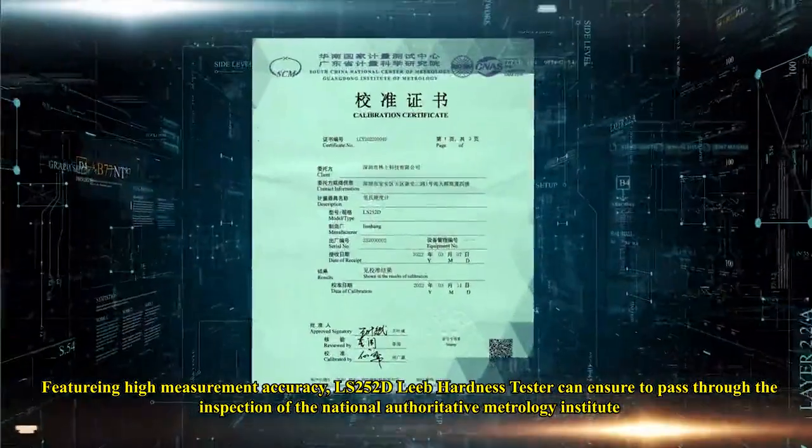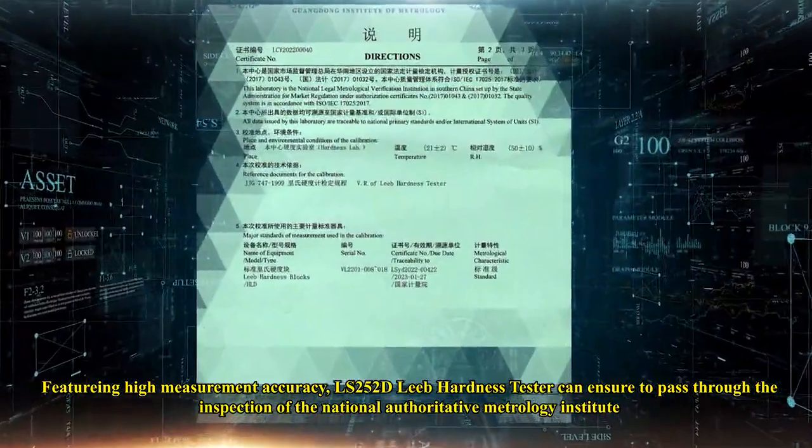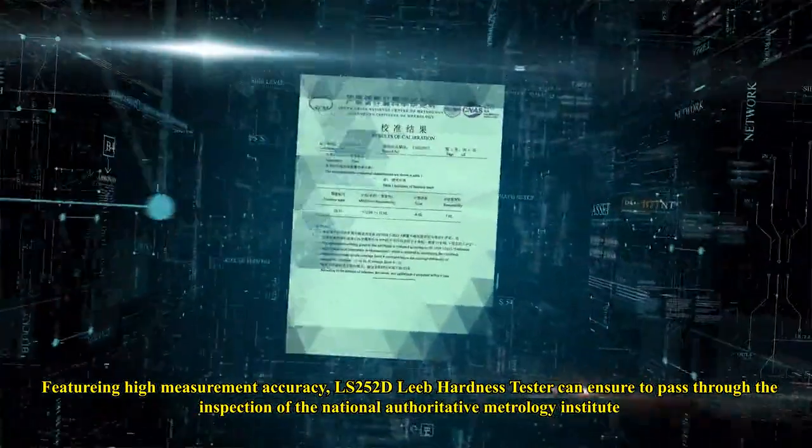Featuring high measurement accuracy, the LS252D Leeb Hardness Tester can ensure it passes the inspection of the National Authoritative Metrology Institute.